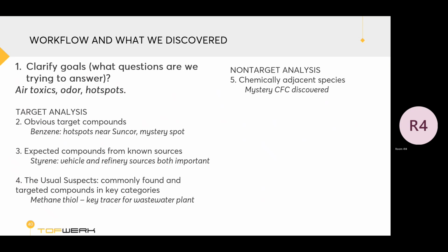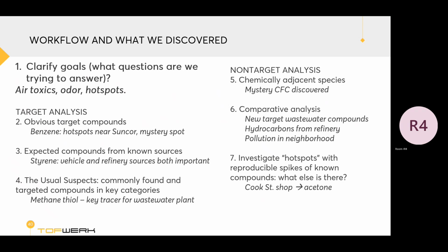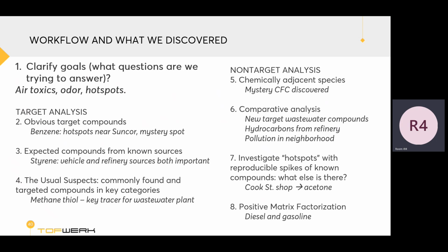Then, analysis. First, search for chemically adjacent species, such as this mystery CFC compound. Then, this helps us find other non-target compounds. Also look at interesting hotspots, and then characterization helps separate mixed sources and identify fingerprints.